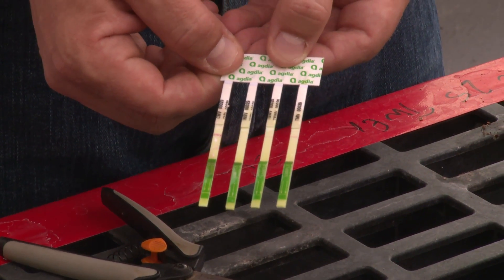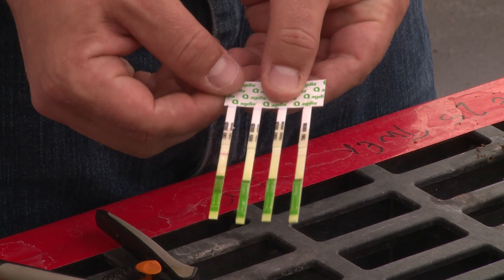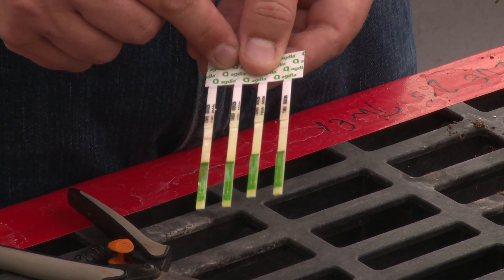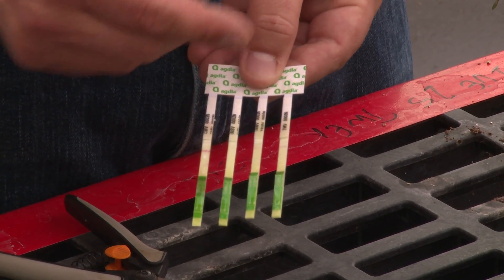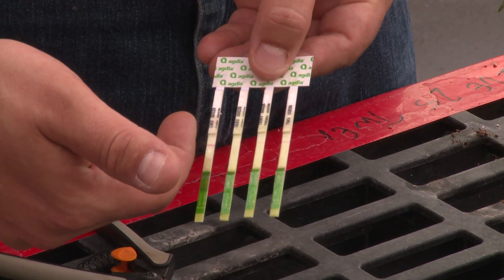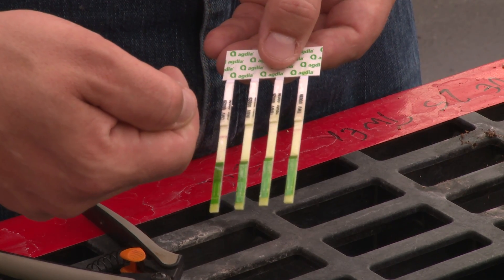When you are interpreting the results of your test, we're basically looking for one or two lines. The top lines are the control lines indicating that enough solution was absorbed to identify the virus. Thankfully, these plants are not infected, so we don't see a second lower line on these tests. But here's a shot of some strips that do show a positive second line indicating a virus is present in our plants.